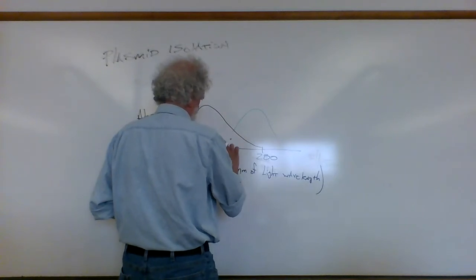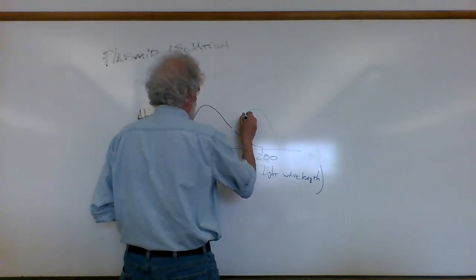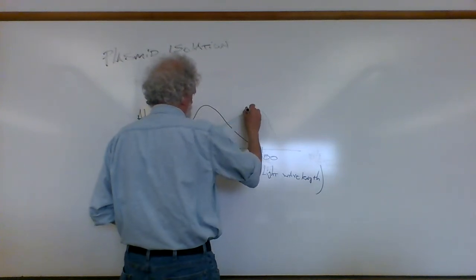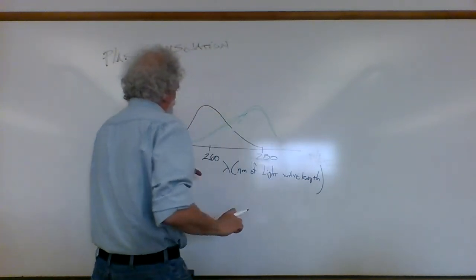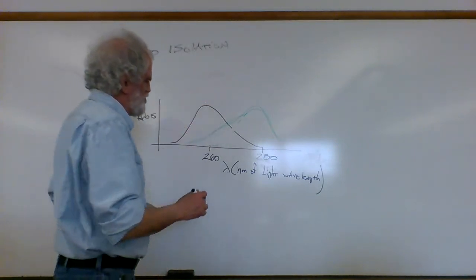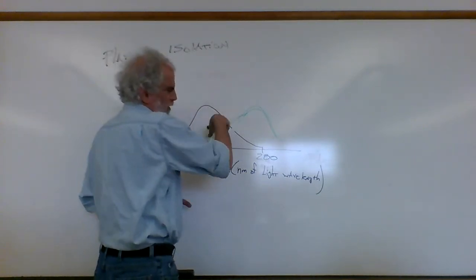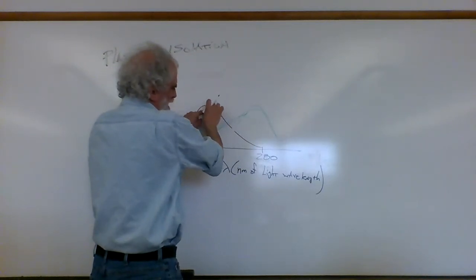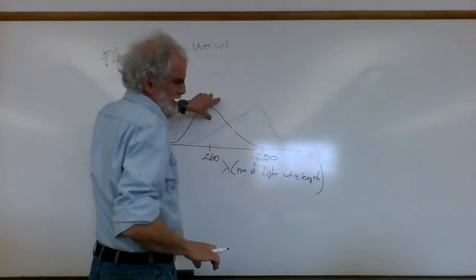And actually it's bigger than that. So what it means is there is actually an interaction between a corresponding absorbance of protein and nucleic acid at 260 nanometers.